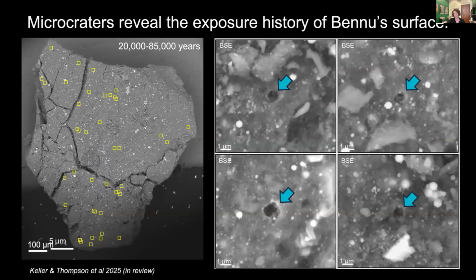Now, we found beautiful large microcraters, but there are some grains that had a huge distribution of microcraters across their surface, not just one big impact crater with all these radial fractures, but instead 1 to 2 micron craters that are spread all across the surface. So this is one of those grains from asteroid Bennu, and each of these yellow squares represents the location of one of these small impact craters. They've got these raised rims, as you can see in the scanning electron microscope images. Some of them have this vesiculated melt, glassy amorphous material lining the crater.